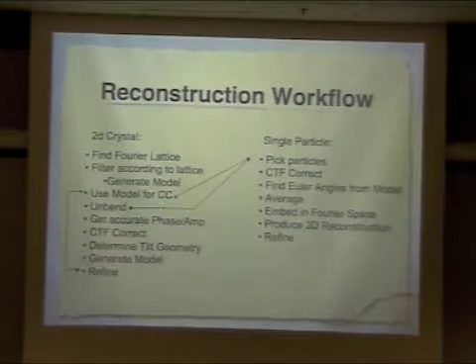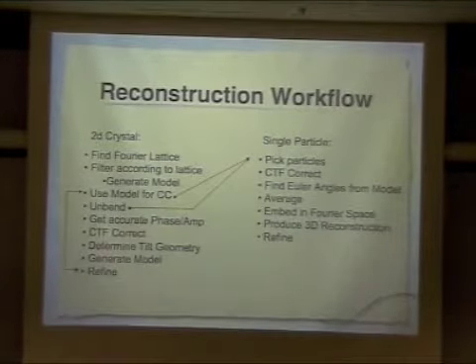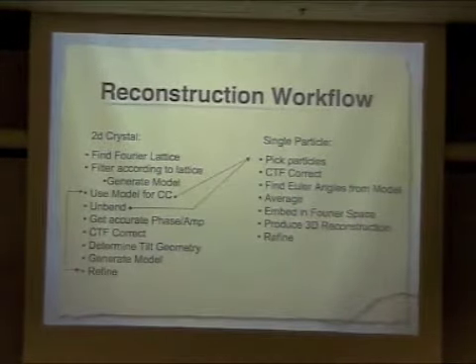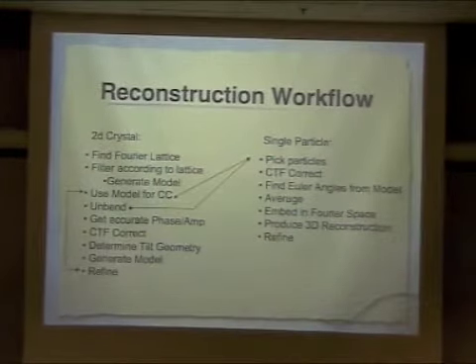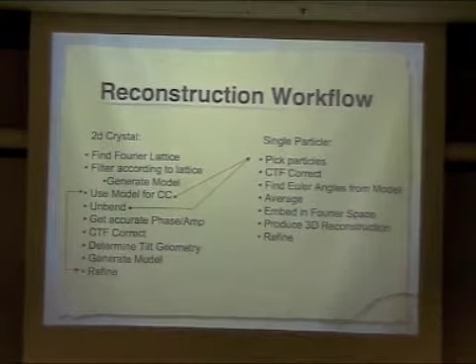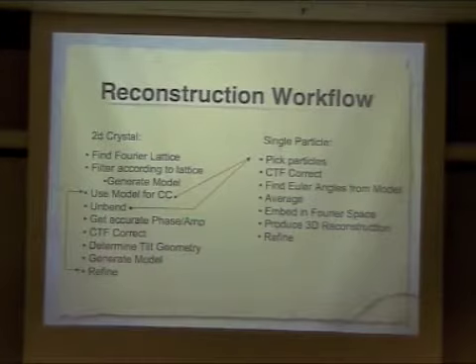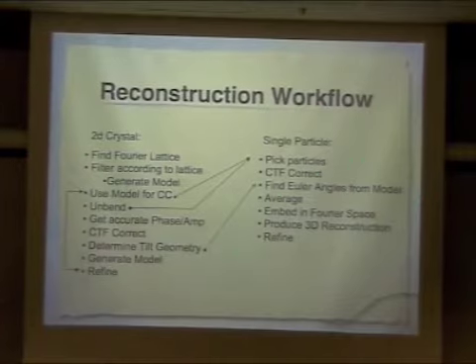So what we've done is we basically said, okay, we've got most of our image in the right place, but some are not. So let's try and push those to where they should be, get them to line up, and then they can participate in this group Fourier averaging. So we've sidestepped the particle picking, but as we described, and we'll probably go over in the maximum likelihood talk, you can use the profile, which generates positions, in single particle processing or in maximum likelihood or so on, as a single particle project from here on out. Determining tilt geometry. Again, this is the problem in single particle.